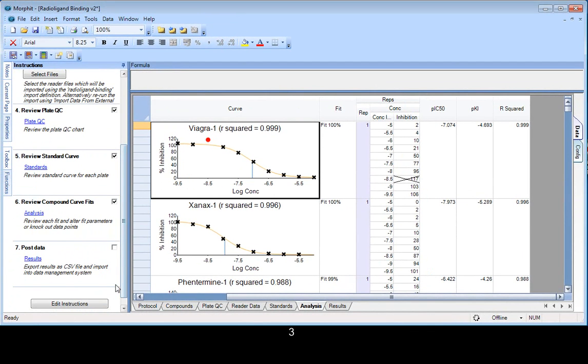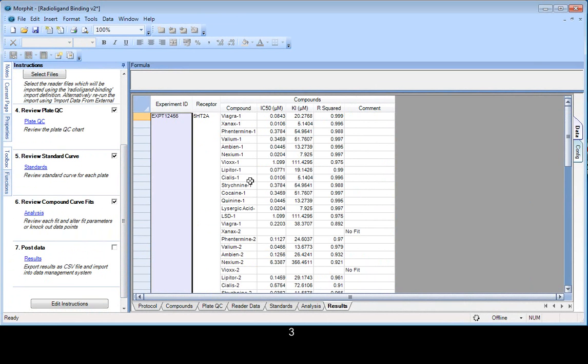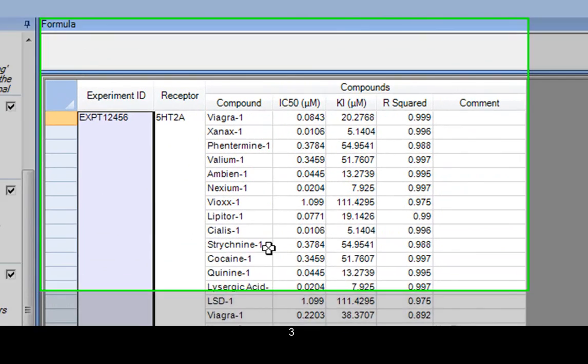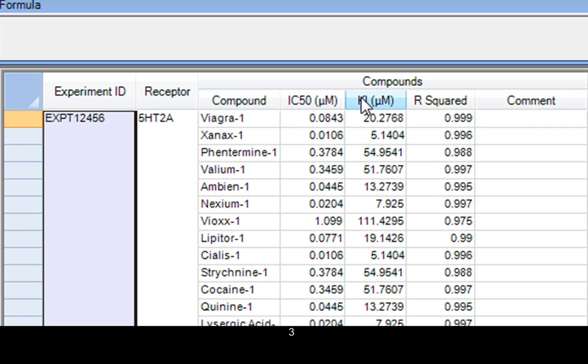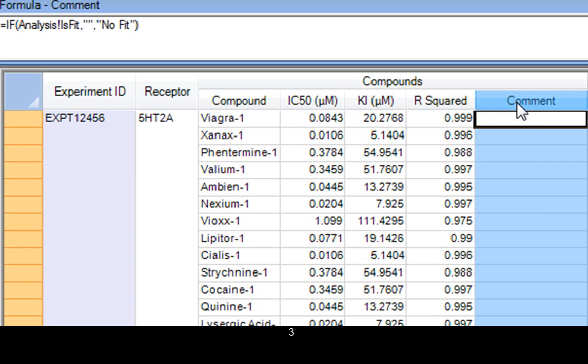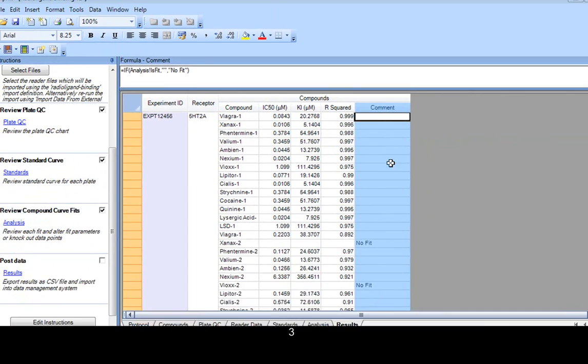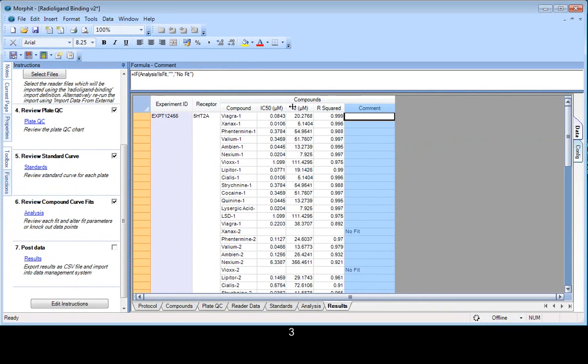The final stage of this particular assay is to publish results. What we've done is created a results table where we've brought all the data together, the experiment, the receptor, the compound. We've converted the values of IC50 to KI. We've shown the R-squared. And we can calculate a comment or simply write a comment in this field.